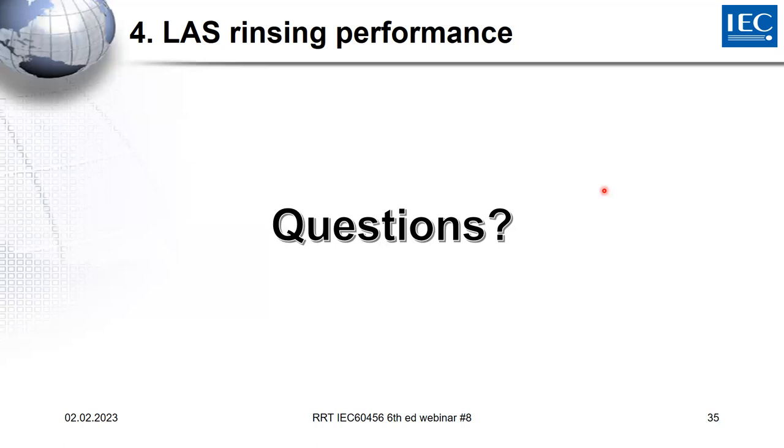During a different test, can we put every swatch into a single little bottle of 100 milliliters, make a measurement on every one, and make an average of our measurements? Theoretically, it's possible. It's also still described in the sixth edition. We don't want to do it for the round robin test here. Okay. You can do it for development. I think it's fully okay for development.